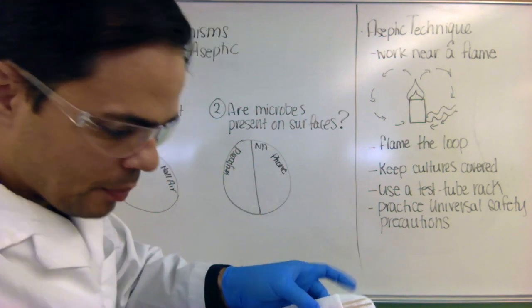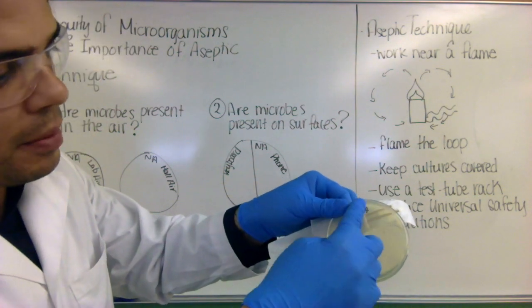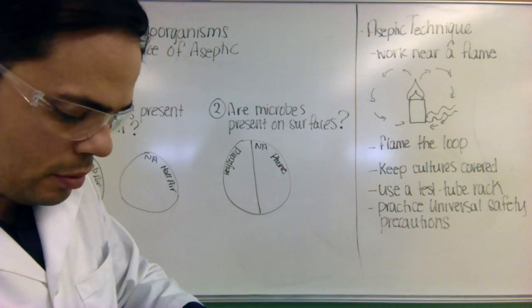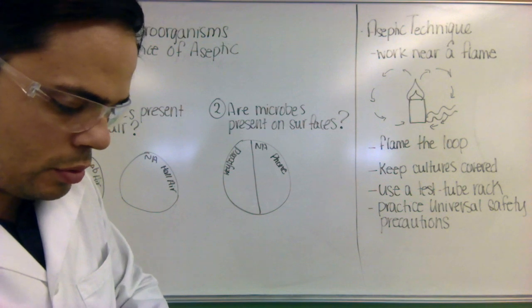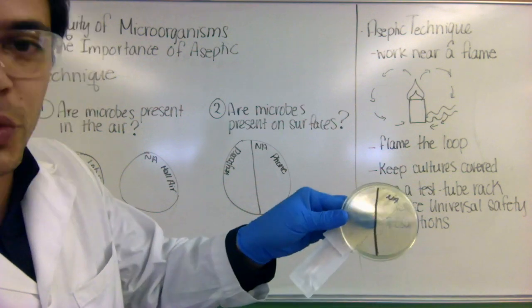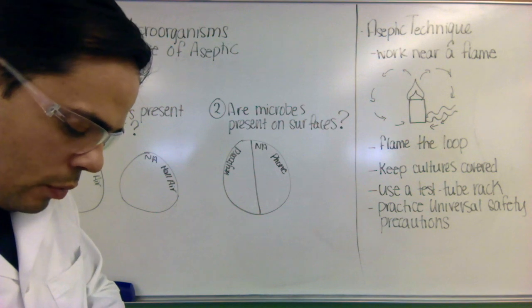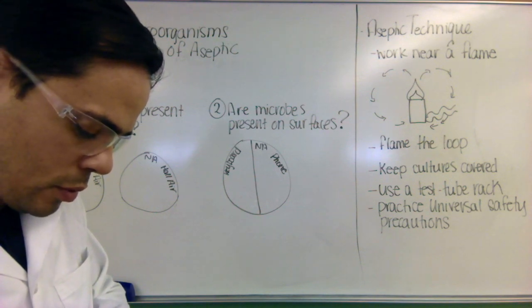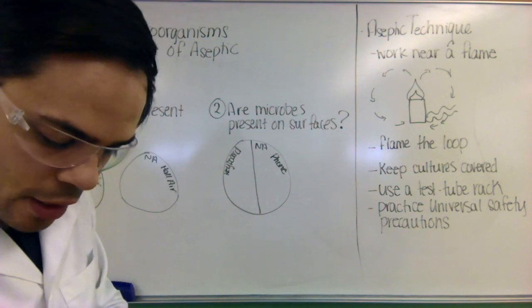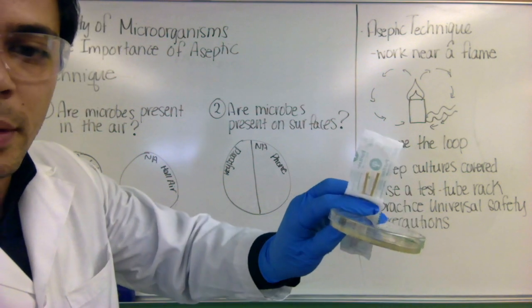And what I can do is I can take my plate and I can draw with a Sharpie a line down the middle there. So I'm going to draw a line down the middle, like so. And I'm going to label it. One side's going to say keyboard and one's going to say phone. You also want to put the date on there as well as your initials. And always label the bottom part, not the top part.